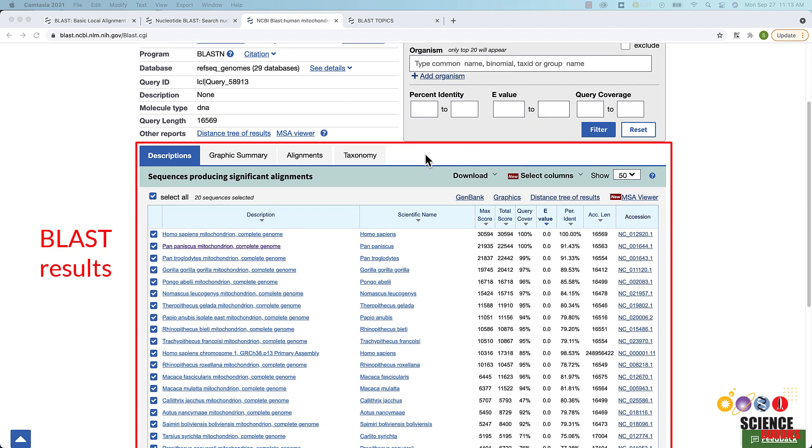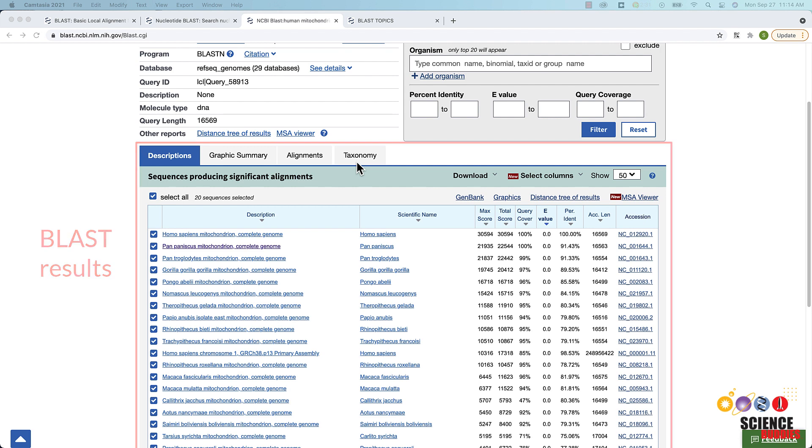Below the top section, the BLAST results are shown. There are four different tabs called Description, Graphic Summary, Alignments and Taxonomy. Each tab presents your search results in a different way.